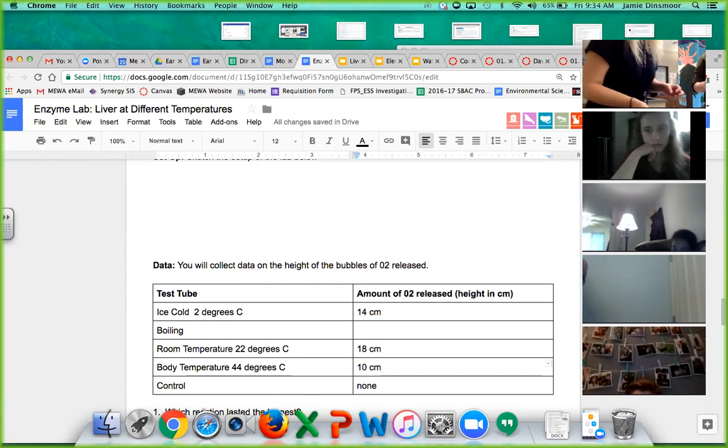Okay, let me see. I'll use my hat. Actually, someone left a sweater. Leave your clothes in the science room and I will use them to grab hot items.